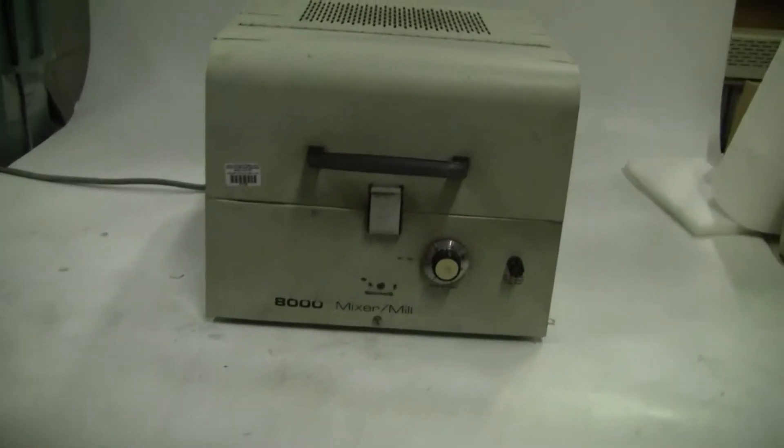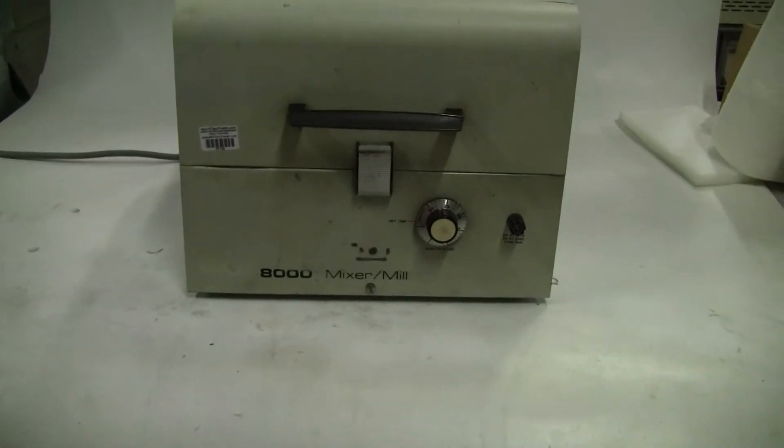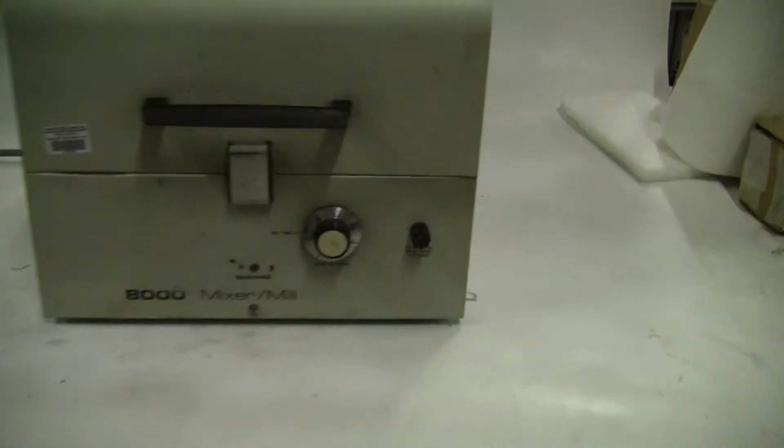Hi, this is Jim from HitekTrader. Today we're looking at a Spex 8000 mixer mill, model 8000-115. It's got a 30 minute timer on it. It's 115 volts. Let's look inside.